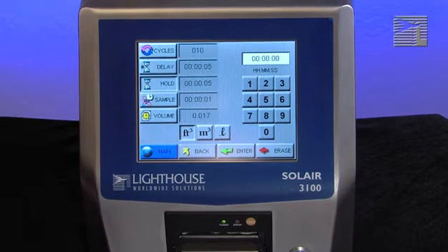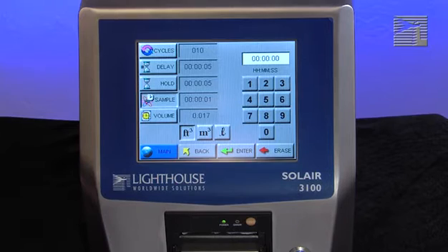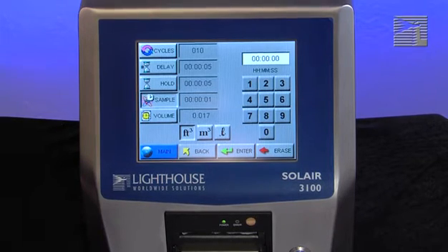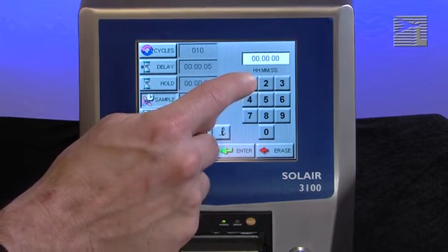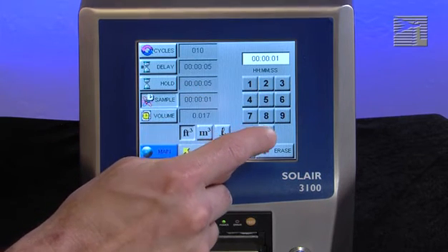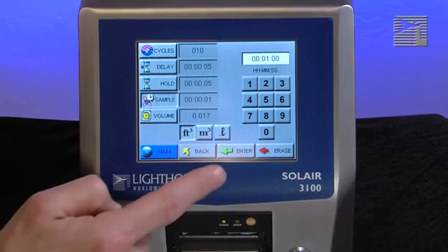The sample time is the duration of one counting cycle. The sample time will count down on the main screen when the instrument is in auto or manual mode to indicate how much time is remaining in the sample. Enter the time in hours, minutes, and seconds using the numeric keypad on the right. When you're finished, press the enter button.